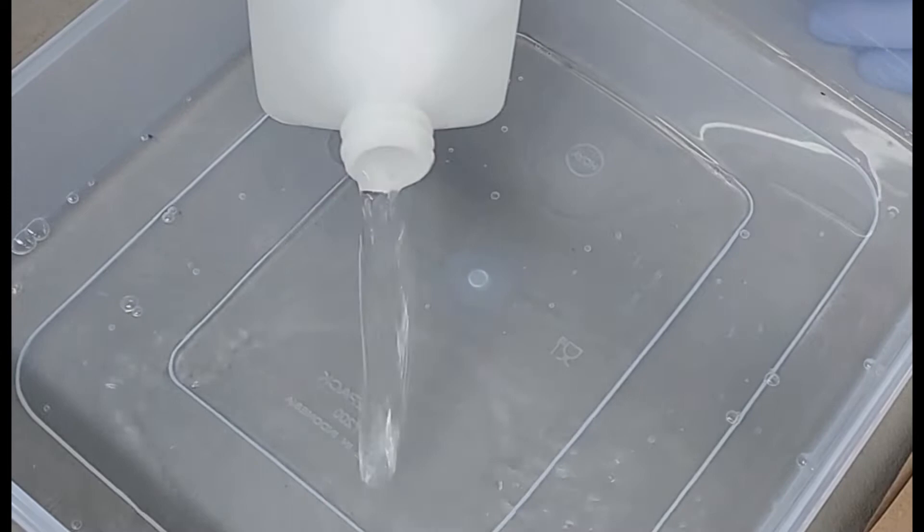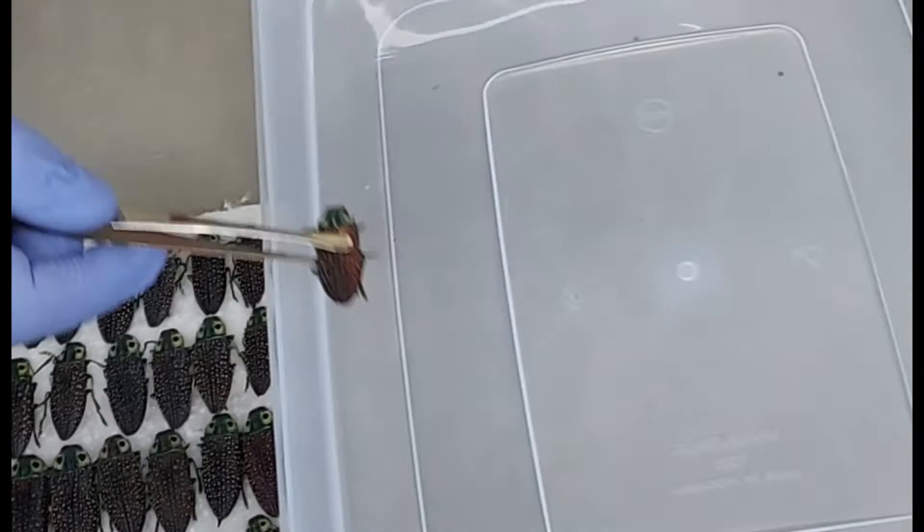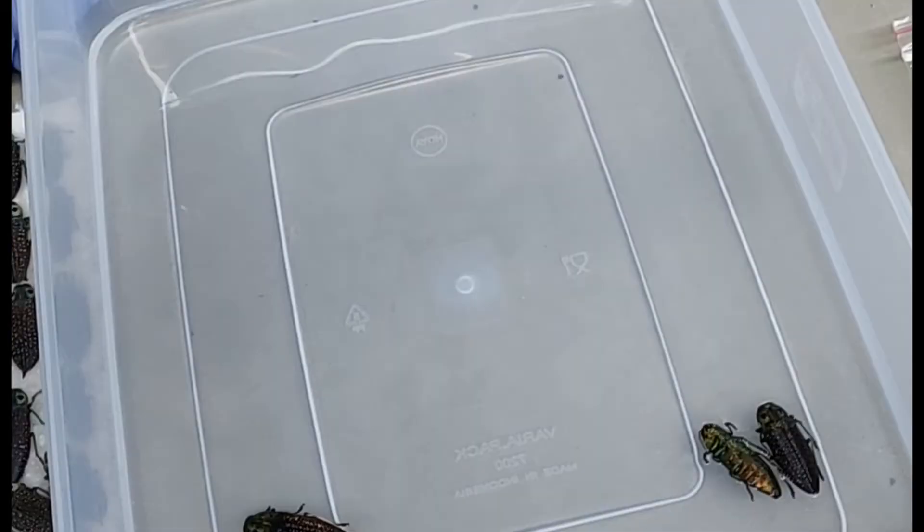Start by filling the container with a shallow amount of isopropyl alcohol. You want your beetles to be able to float on top of the alcohol without touching the bottom. After your container is filled with alcohol you can start filling the container with your beetle specimens. You can put multiple species and beetles in the same container, just make sure you use an appropriately sized container for the job.